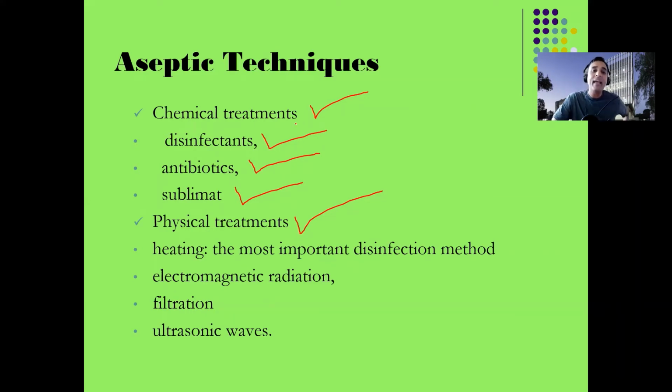So the disinfectants, and in some cases antibiotics. I rarely recommend or use antibiotics because antibiotics create stress in plants, and many plants are susceptible to antibiotics, which do not allow them to grow. So my suggestion: antibiotics only for animal cell culture, guys. But when you have something very critical, you can use a low concentration of antibiotics for plants. When you have no other option to save your plant material, then you can use antibiotics. Okay, a pre-wash, a small treatment, but don't grow them in antibiotics, because most plants become stressed.